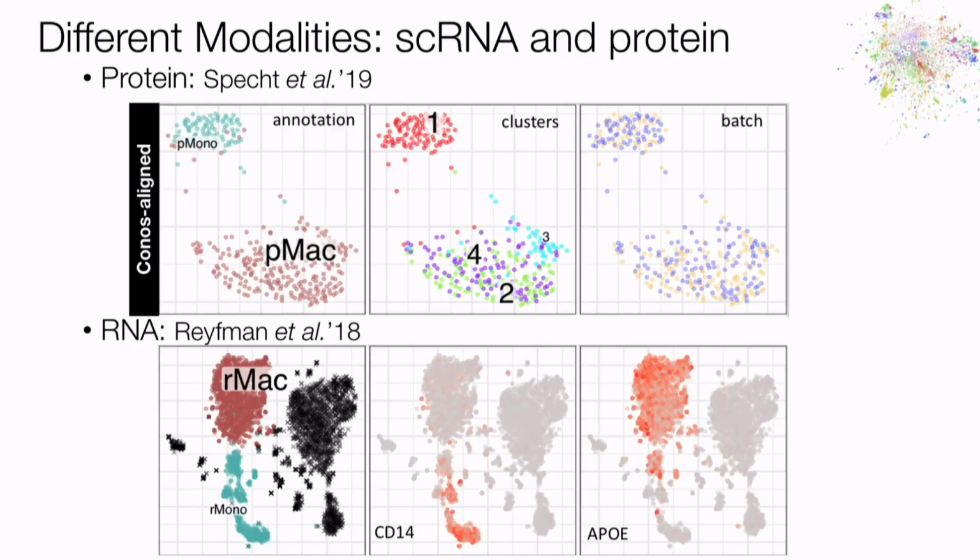Yeah, so if you go back, let's say, to this initial picture where I introduced the data set, here I analyzed the RNA data without using any protein, right? And these genes were used there because we use a very large set of genes, but they're renormalized according to this relative variance. So maybe not all, but probably most of them were used here because they're still differentially expressed, even though weakly.